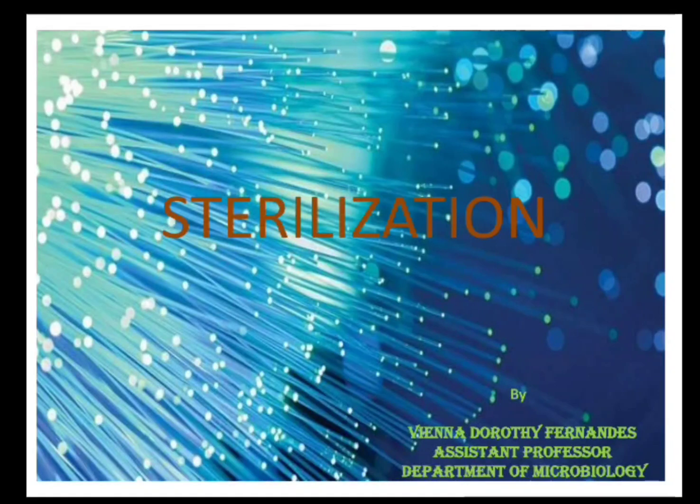Hello students, we will be talking today about sterilization, or we could say control of microorganisms, because all the methods, all the techniques that we are using are not sterilization. The different terminologies with respect to control of microorganisms we have studied in the previous class. So let us see what are the different methods of sterilization or controlling microorganisms.